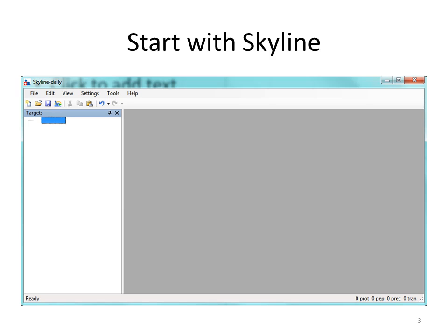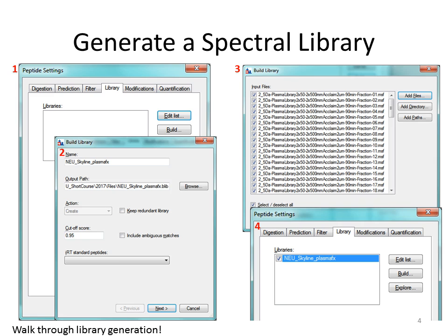Okay. So does everybody have Skyline open to an empty document? It should look something like this. Because you have Skyline daily, you might get a little update window that says, hey, update Skyline. Let's skip it. Not because there's anything wrong with updating it, just because the Wi-Fi is a little slow, and all of us will be fighting for bandwidth to download it. All right. Does anyone not have this window open? Because you don't want to fall behind on the first step, right?